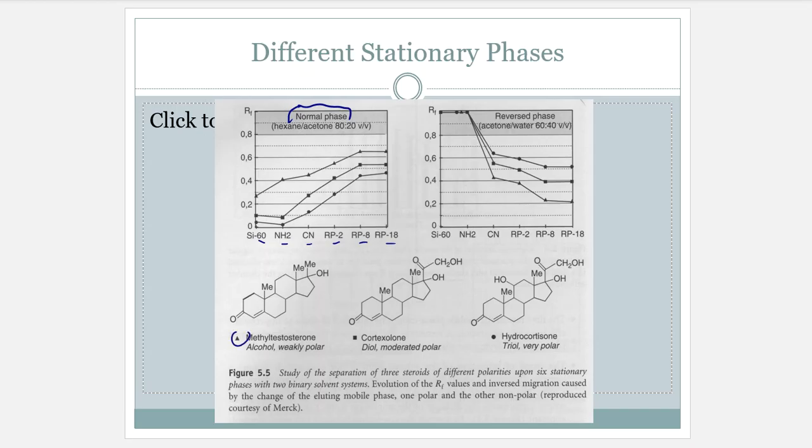So here are the things that we have injected or that we have applied onto the plate. Again, very common all the way through. This basically was coming from our previous example that we talked about in a way. And then if we take a look, we get 3 spots that show up on the plate. That's great. They're separated, sure.